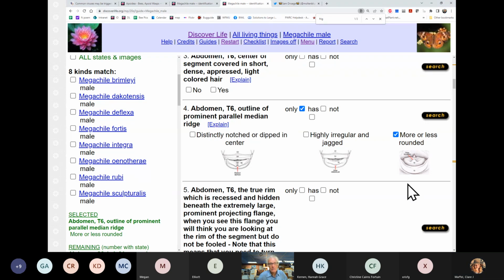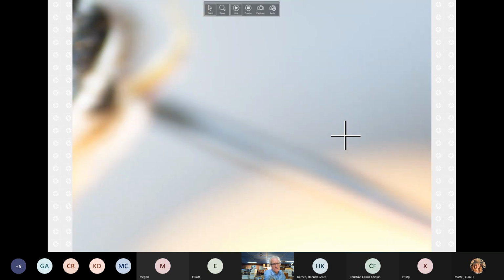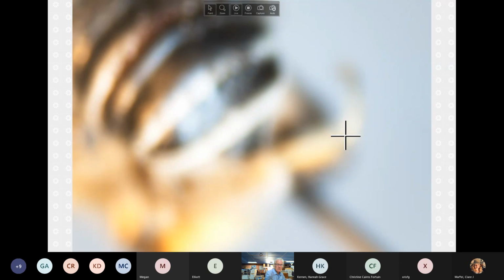All right. Because there's more to do, like with the females for all these things. Here is, let me just turn this a little bit more. Make kind of ruby.